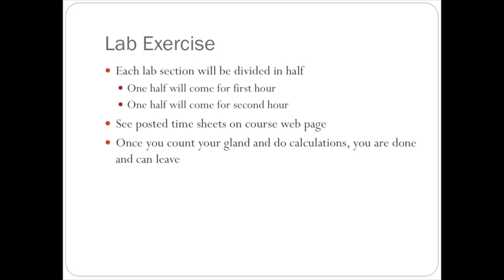So this lab is really more instrumentation based, but it is the clinical application that really for us is important to consider. And as I mentioned, this is one of those topics that people think, especially regulatory people, think are very important. When I worked in Chicago, our state regulatory agency basically just said, we're coming in one day and we're going to take a pharmacist into the conference room and we're just going to ask them questions about bioassay and air monitoring.